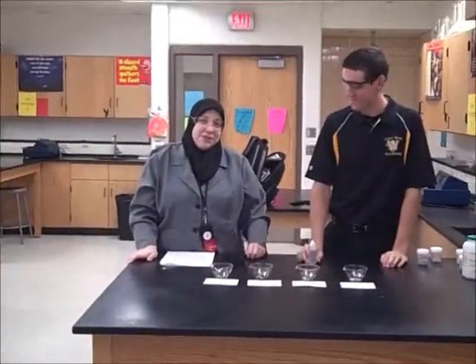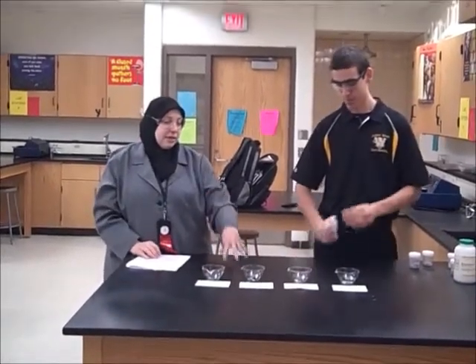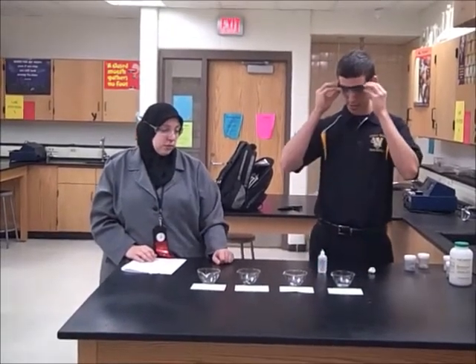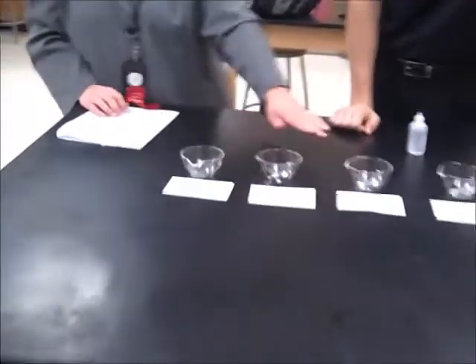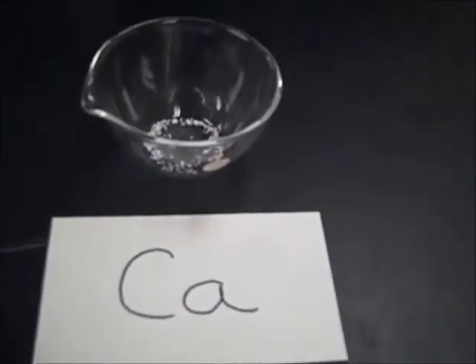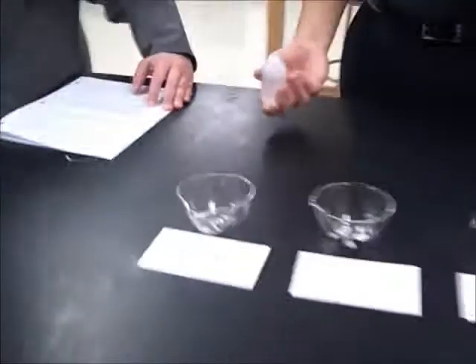So we're back at part two with Superstar Nick. Now we're going to test the metals with acid. We have 6 molar hydrochloric acid to use. We've already set up the metals in lovely little containers. We have magnesium, zinc, tin, and calcium. All white or silver metals. Now we're going to see what the reactivity is with acid. So just don't drink it. Go ahead, add some in. Start with the magnesium.